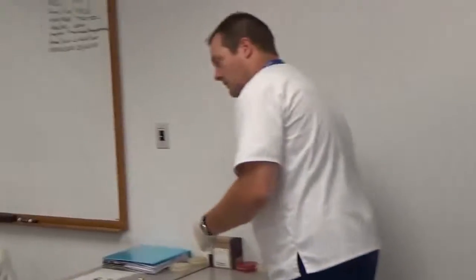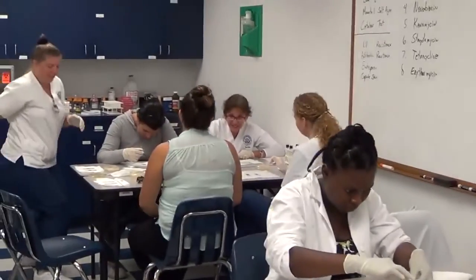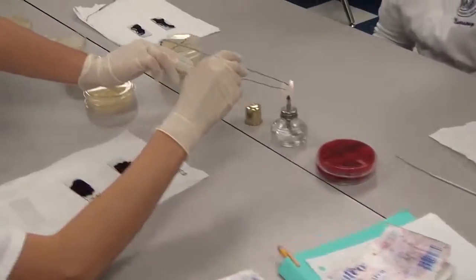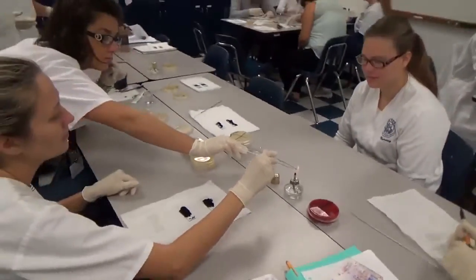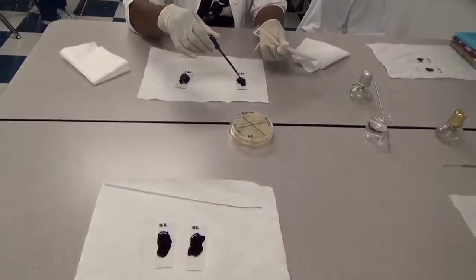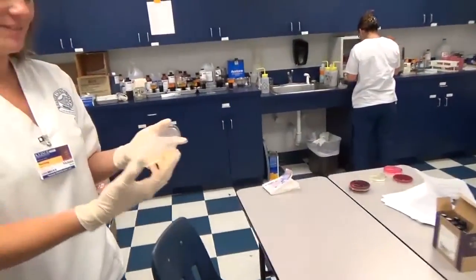This is the microbiology class. Dr. McGarry, hi! What is it that your students are doing today? Fantastic! What is that you have there?